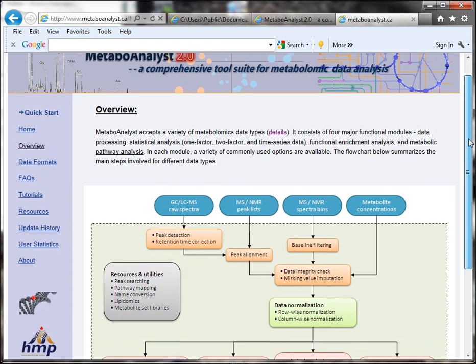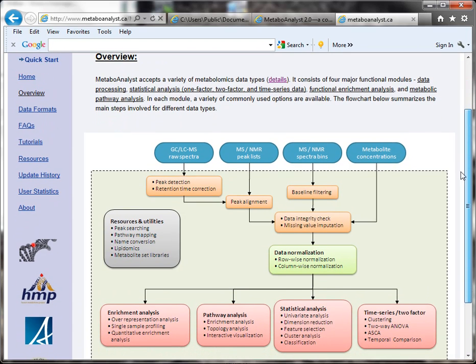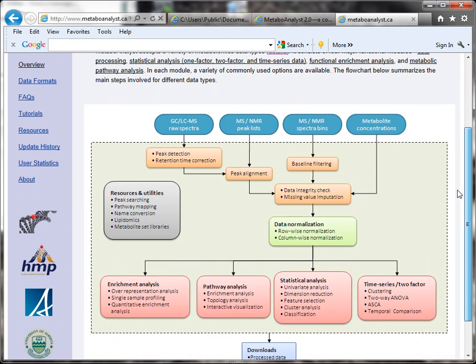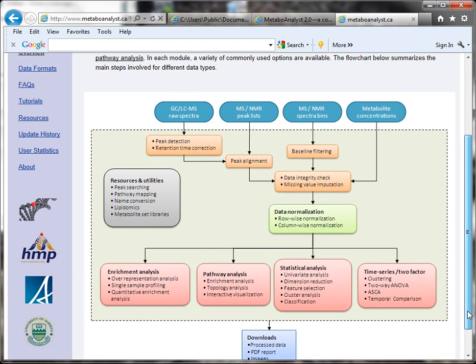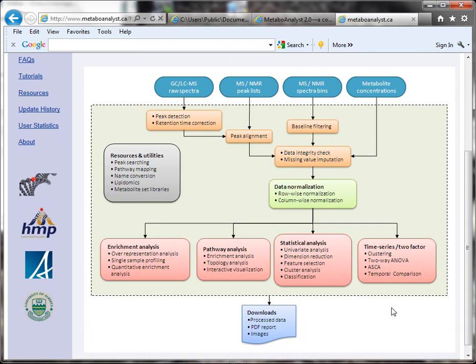They have a really great figure that shows all the different kinds of metabolic data that you can upload, and then all of their abilities to actually analyze and format your data. Then you can see all the different types of analyses that you can do, and you can download your processed data and create publication-quality images.